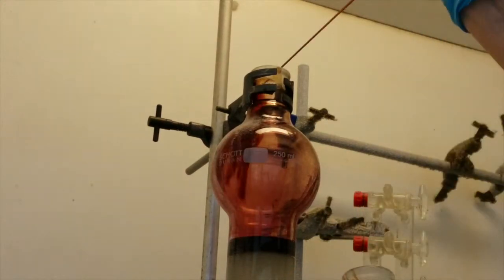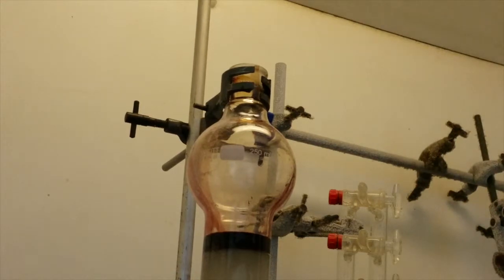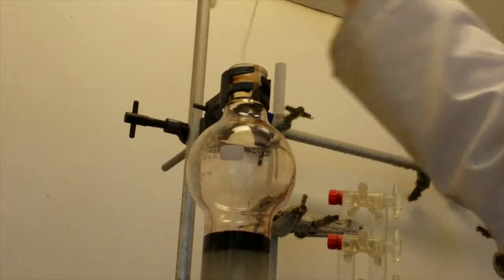Rinse the round bottom flask out with a small amount of dichloromethane and then use this to wash any product still remaining on the sides of the column so that everything is loaded onto the silica.